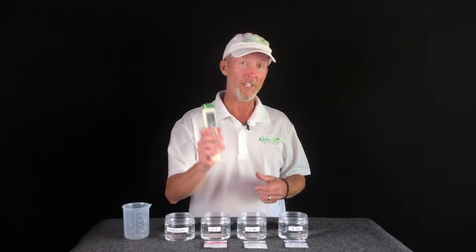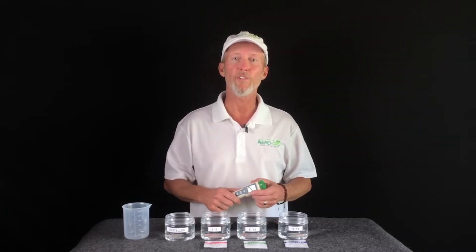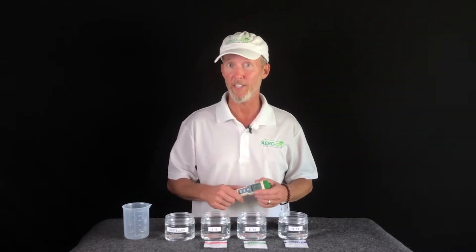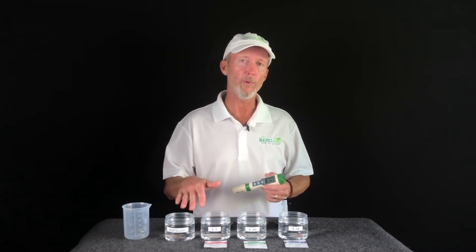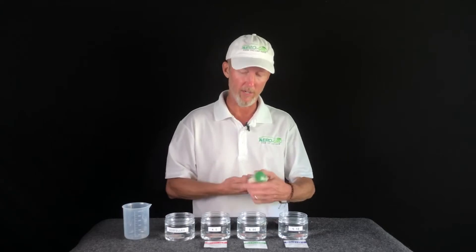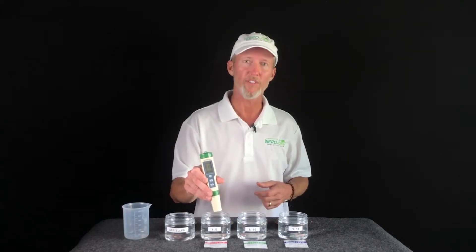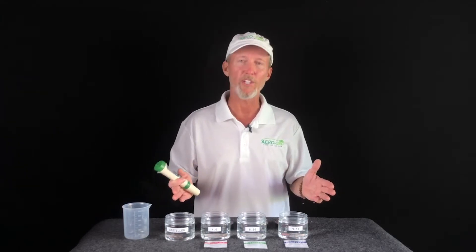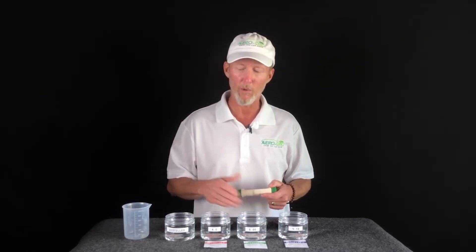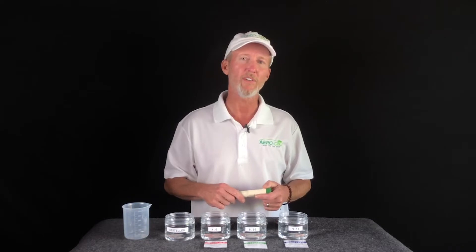One thing I want to mention about your new meter is that it has what's called auto calibrate recognition. What that means is that it doesn't really matter what order you put these solutions in — the meter will detect what solution it's in the moment that it hits the water. So it's always best to stay organized when you're doing this; I would keep them in order, but you don't specifically have to.